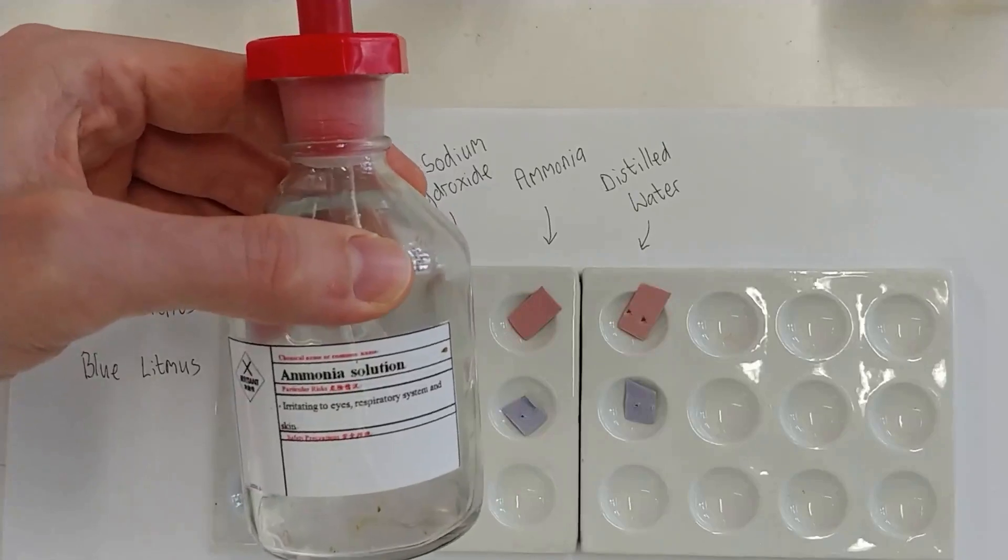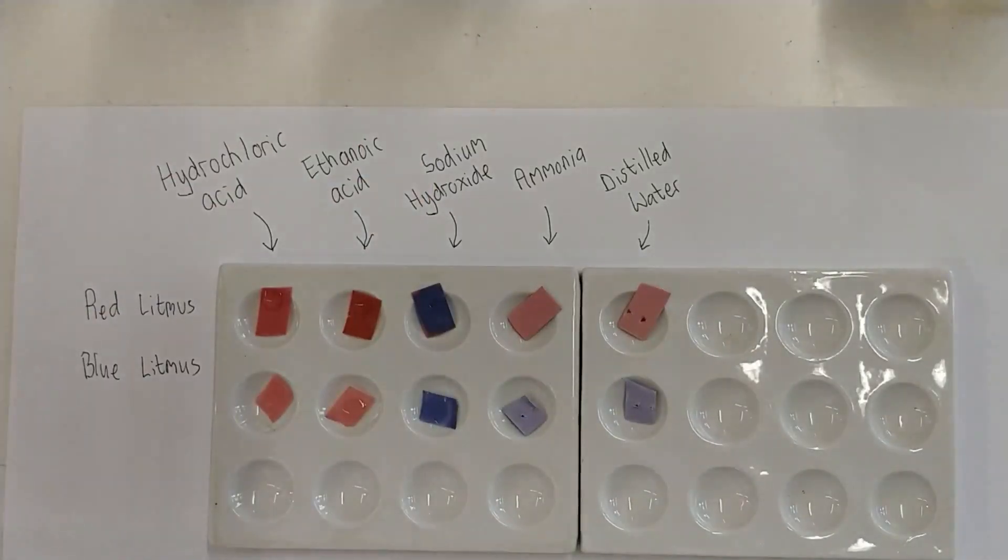Next, we take ammonia, which is another alkaline solution. And we drop one drop onto the red litmus, and it changes blue, and one drop onto the blue litmus, and it doesn't change.